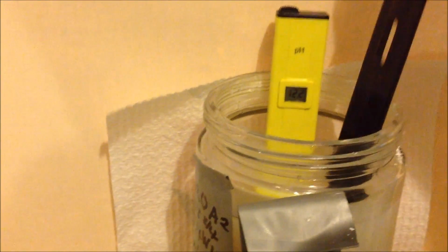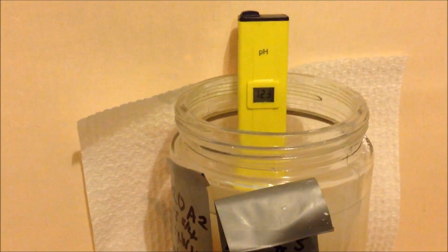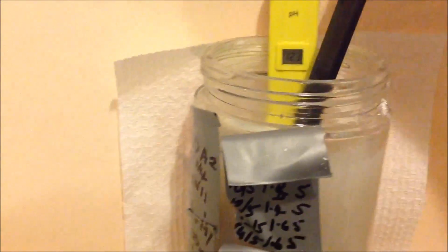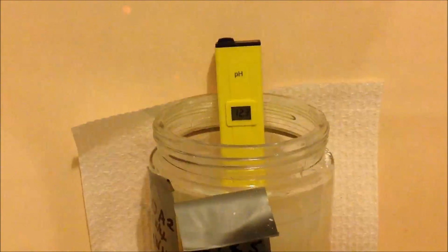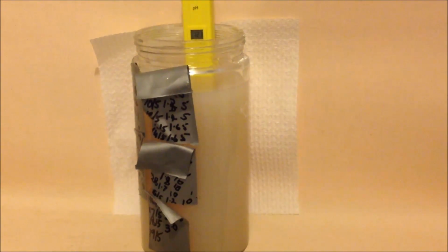Oh, look at that. I don't know if you can see that, but the pH has gone to 12.3. I'll just see if we can focus it better. 12.3. So we were getting some layering. Yep, that's 12.3. Well, I'll continue with this experiment, but I think I'll have to redo the whole thing back with a stirrer.